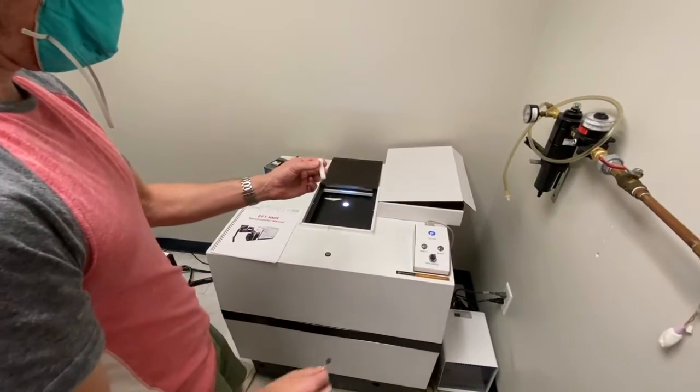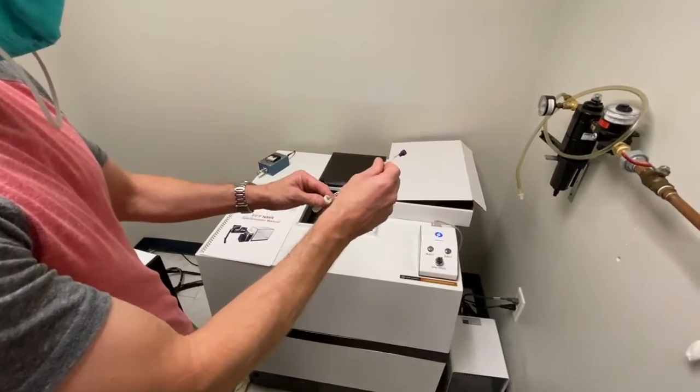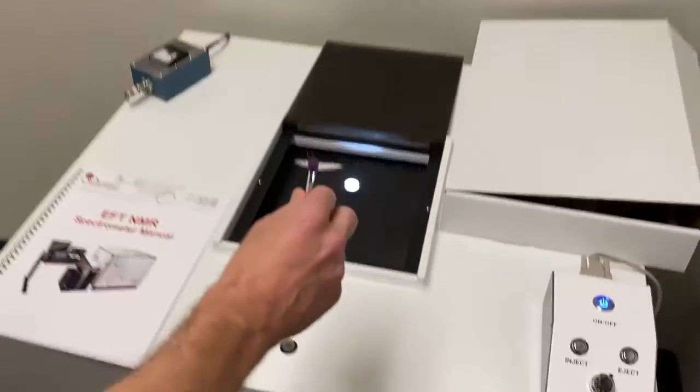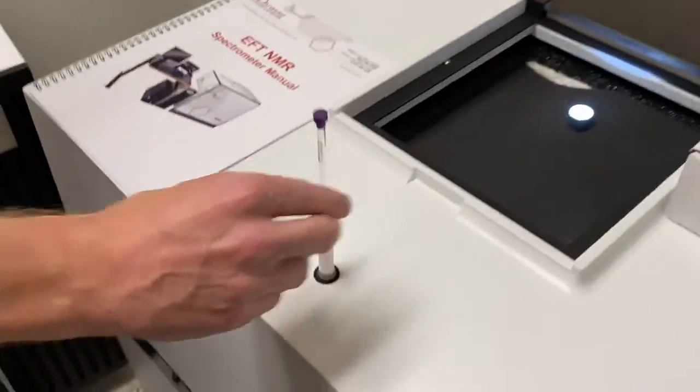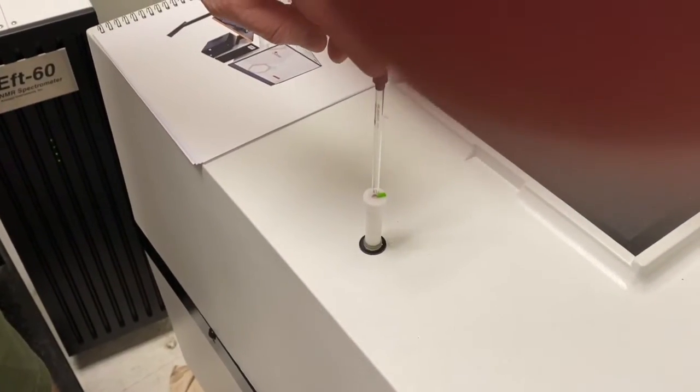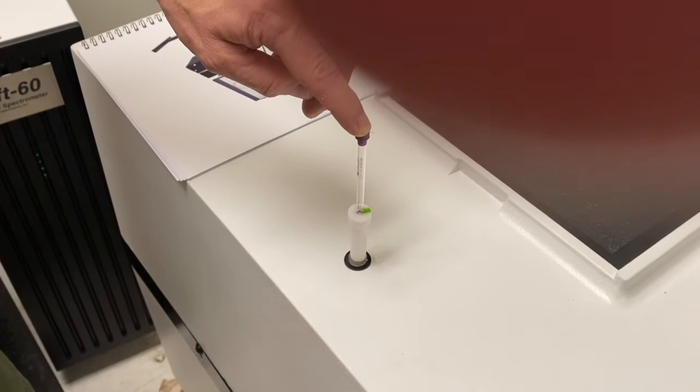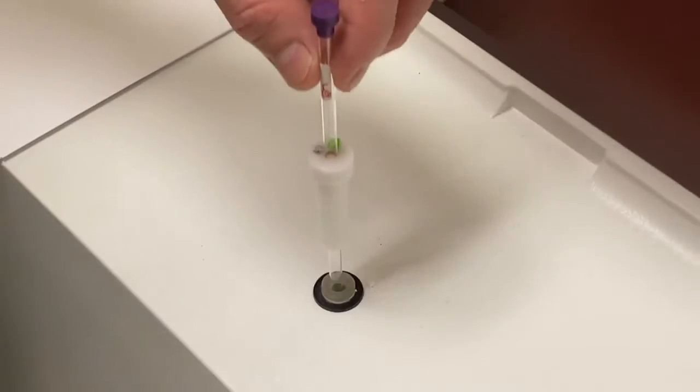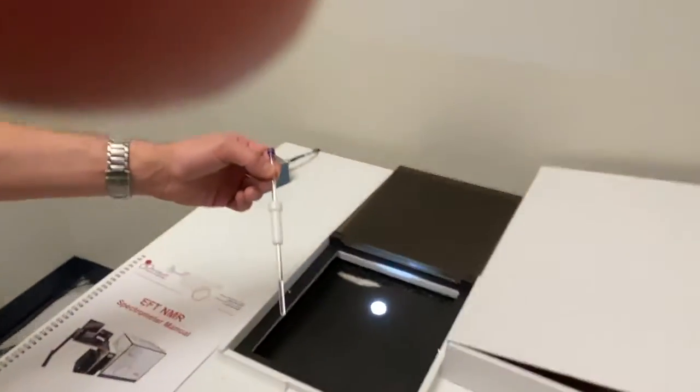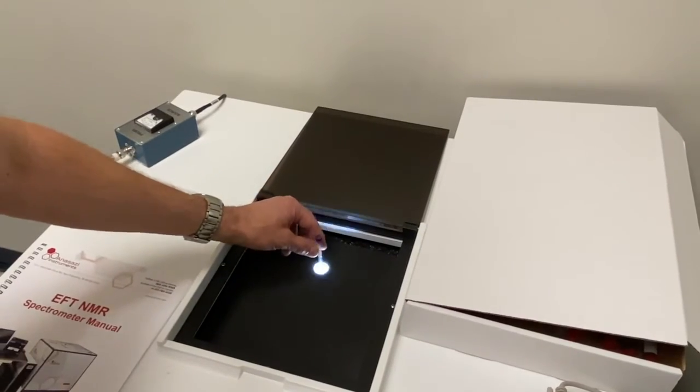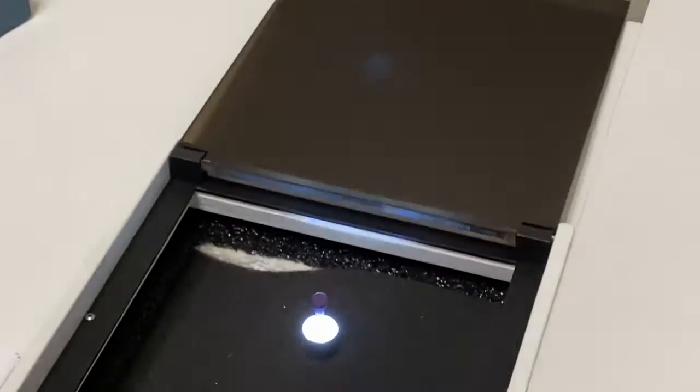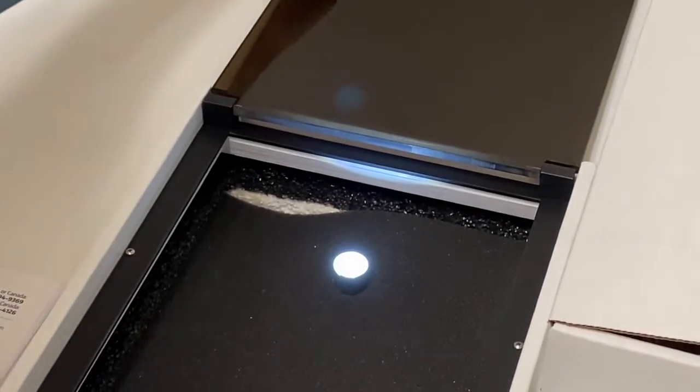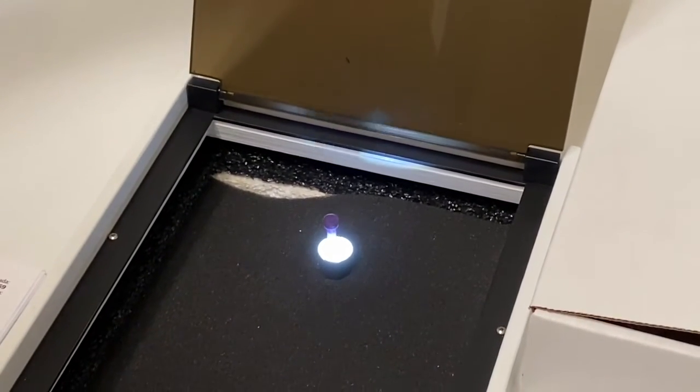Take your tube and then put the spinner on. You put the spinner on the bottom and then you put the tube into the depth finder and you push down until it stops. Then put the tube into the lighted hole right there and it will bounce around on air and then hit inject. It disappears into the magnet.